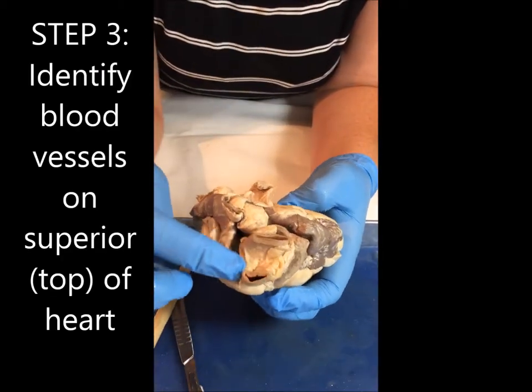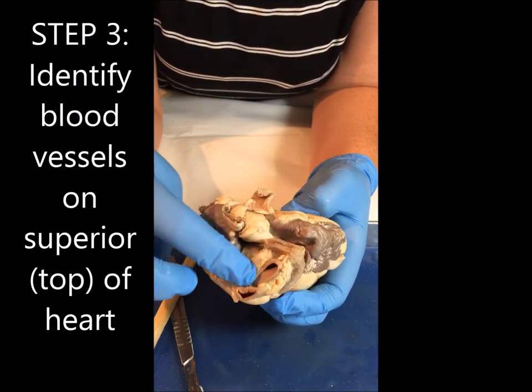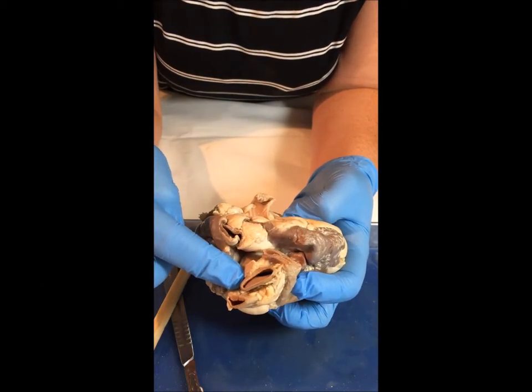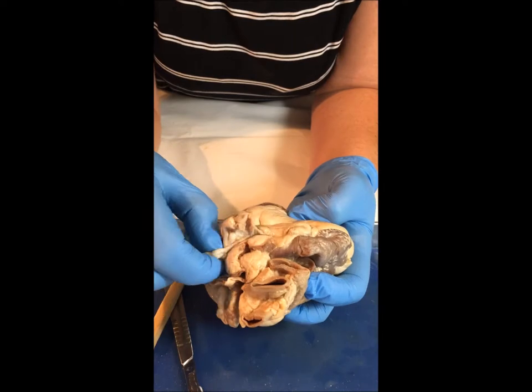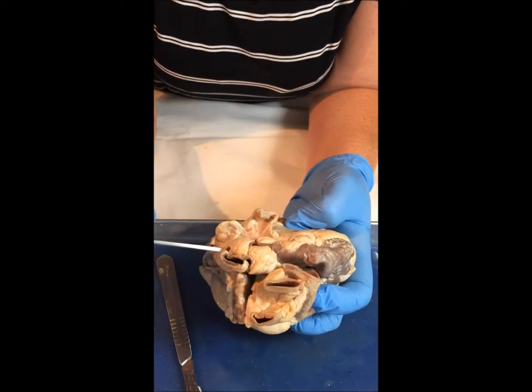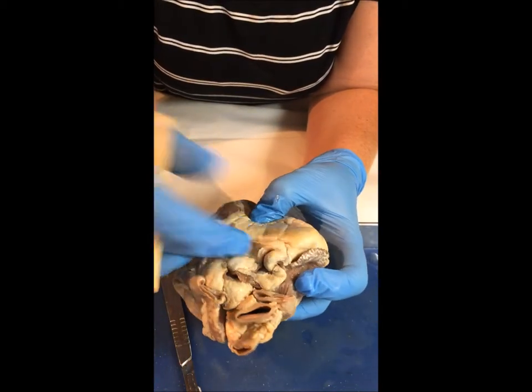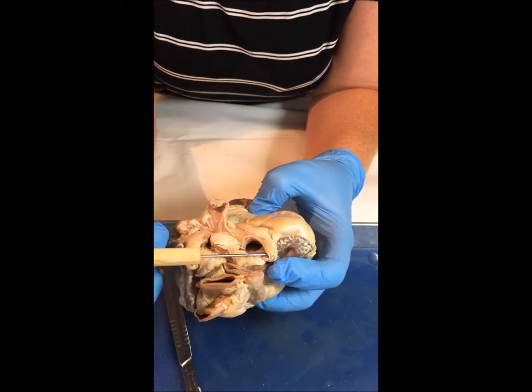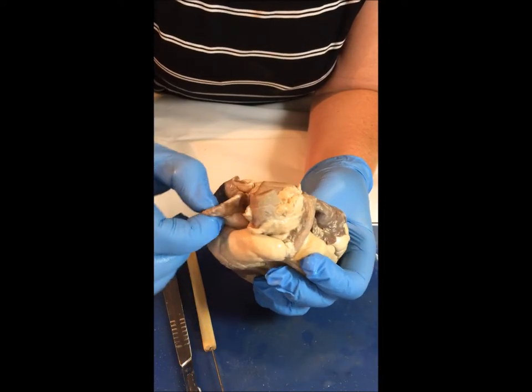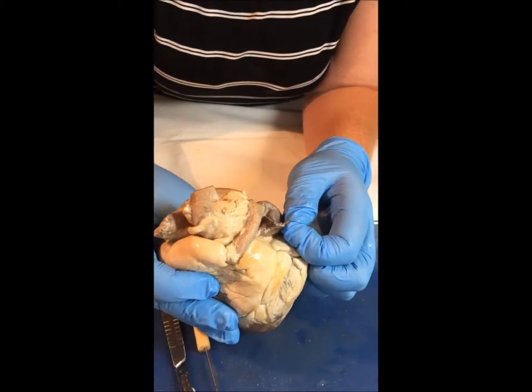If I look up top here, I can see the pulmonary trunk. These two branches here will lead me to the aorta — this is the brachiocephalic or the left branch. Back here, this is going to be the superior vena cava. And then if I look all the way back over here, I will be able to see the pulmonary vein coming in. The heart also has these little pieces called the auricles, which means ear — so the little flaps right here are the auricles.